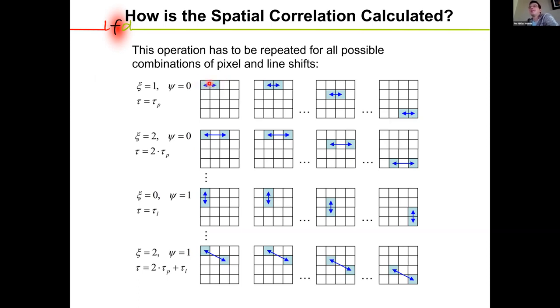And we are typically doing this analysis in a whole region of interest, so an area of several pixels. So we repeat this calculation for all pixel distances of 1 for this small sub-image. And this will give us the average time it takes a molecule to move from 1 pixel to the next.